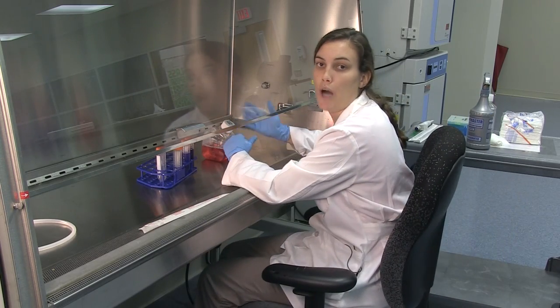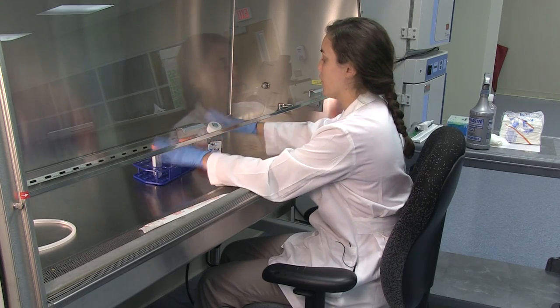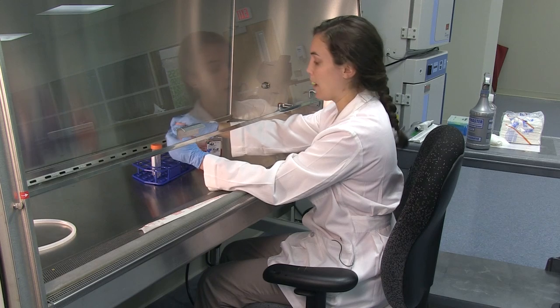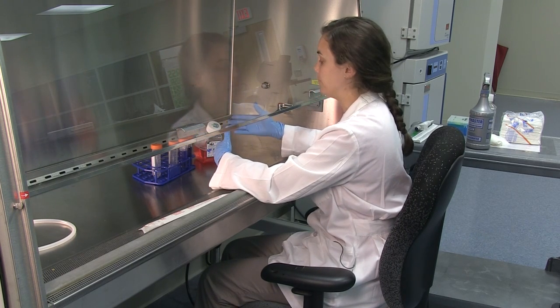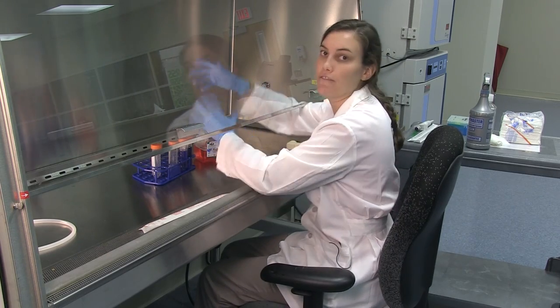I'm going to demonstrate how to properly transport media while keeping it sterile. It's important that you loosen all the lids of the media bottles or tubes that you're working with. This will help prevent you from touching things that should not be touched when you're trying to force open a bottle.